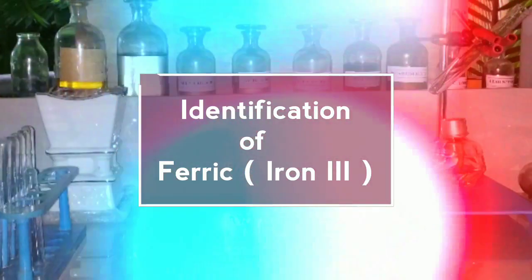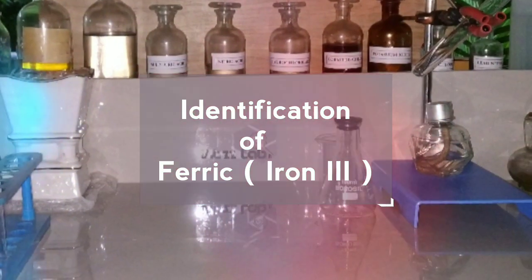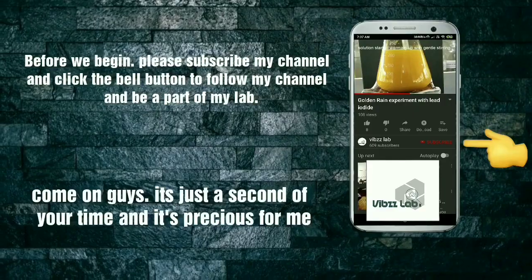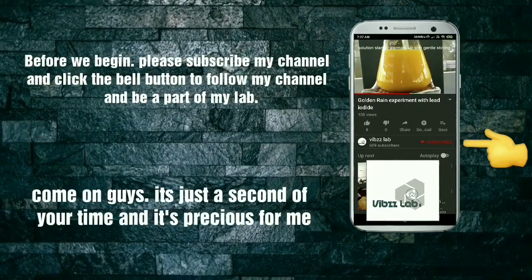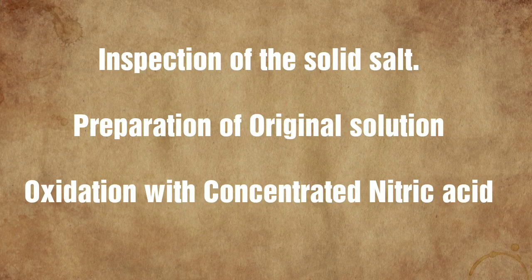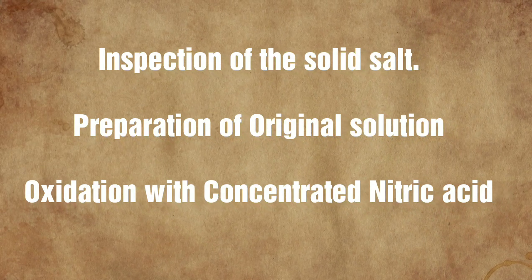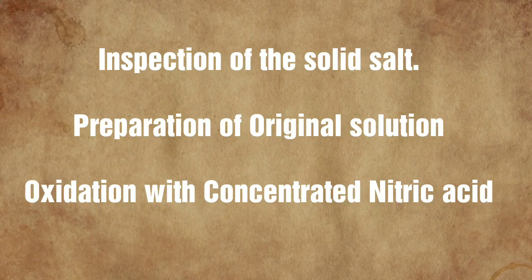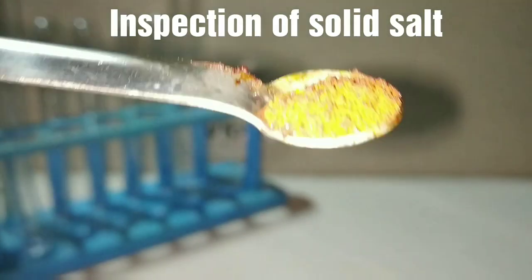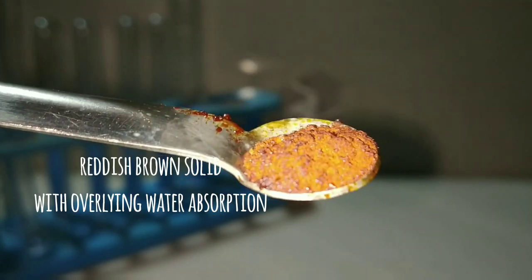Hello friends, today we would be doing the identification of ferric ions. First of all we inspect the solid salt, then we will be preparing the original solution, and we will oxidize the original solution with concentrated nitric acid. On inspection of the solid salt, you can see that it is reddish brown in color.